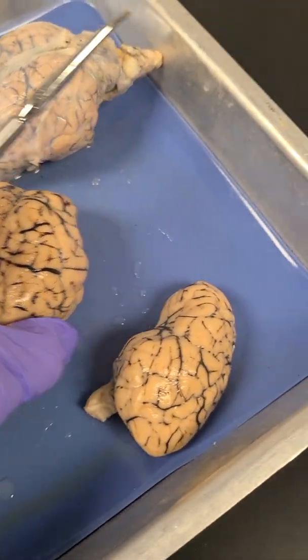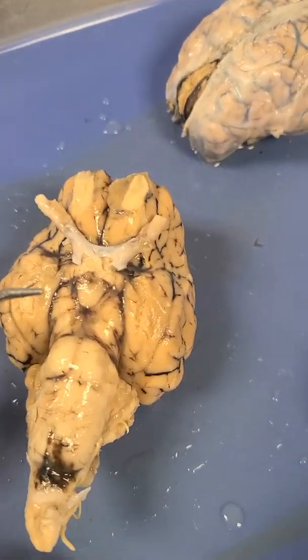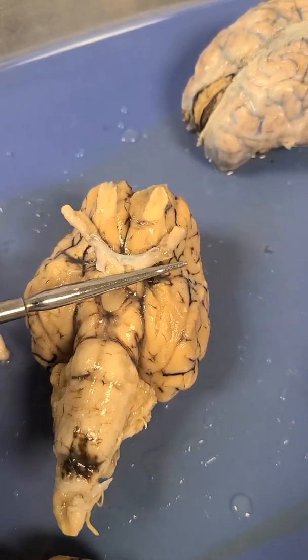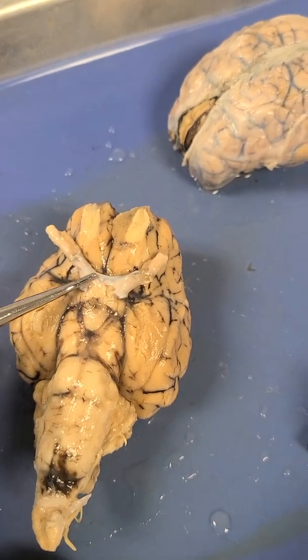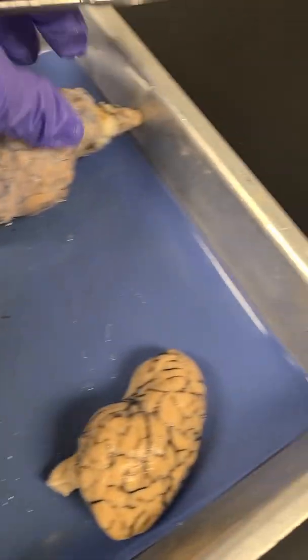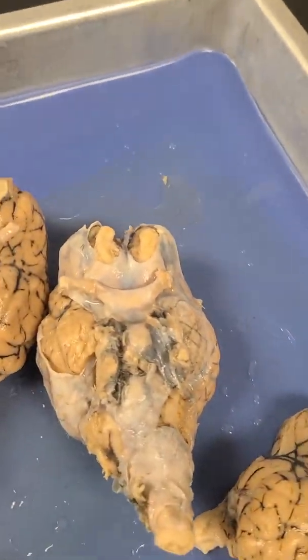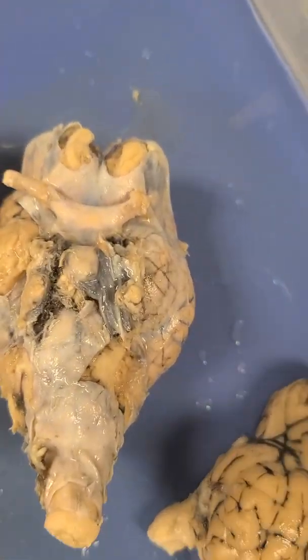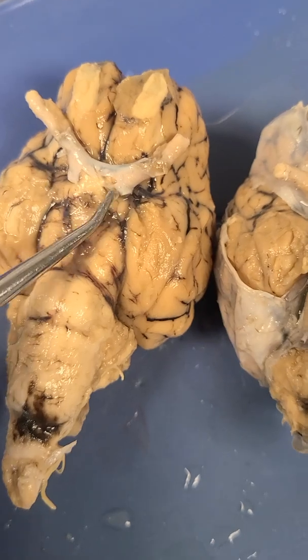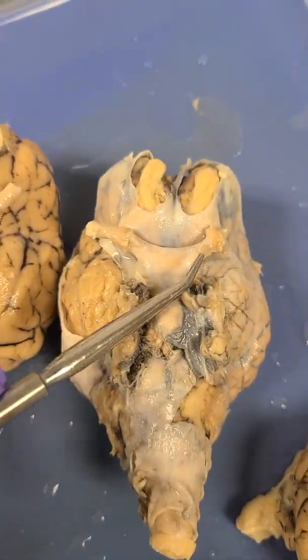And then if we flip it over, I'll show you on this version. These are the optic nerves right here. This is cranial nerve 2, and this is the optic chiasm, where they meet and cross. If you look at the one that still has the meninges on it, you can see, on this one they did a good job of removing everything, the optic nerves are right here.